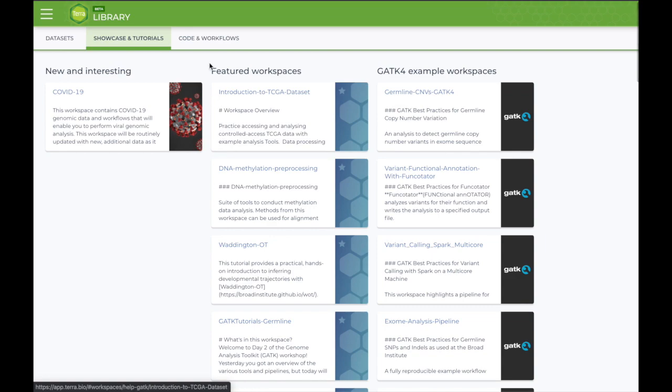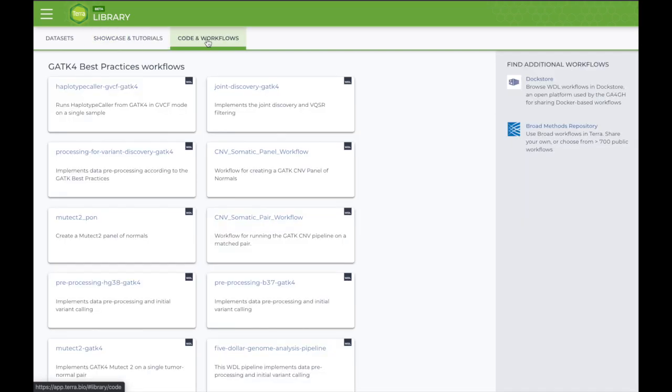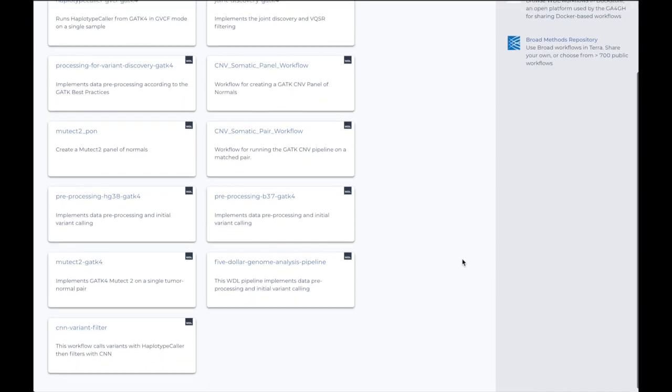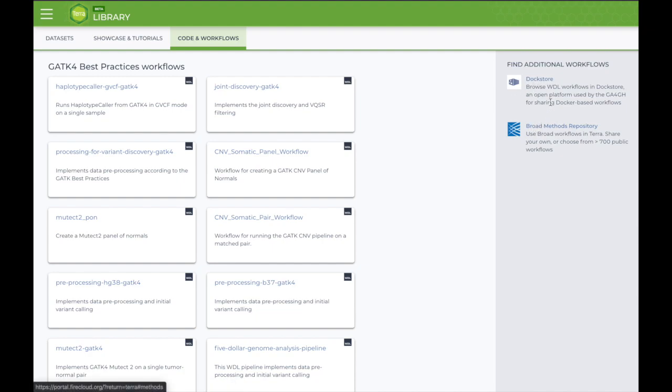Finally, in the Code and Workflows tab, you will find a number of GATK-4 resources that have been optimized to run from within Terra. Additional workflows are available in the Doc Store and in the Broad Methods repository. These have been submitted by users, and cover more specific analysis needs.